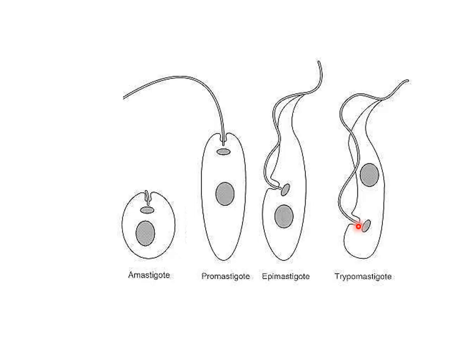For trypomastigote stages, the difference with promastigotes and epimastigotes is that the flagellum is all over the surface of the stage, and this flagellum is always close to the kinetoplast as in all of the other stages. However, the difference between trypomastigotes and the others is that this kinetoplast occupies a posterior position if we compare it to the nucleus.